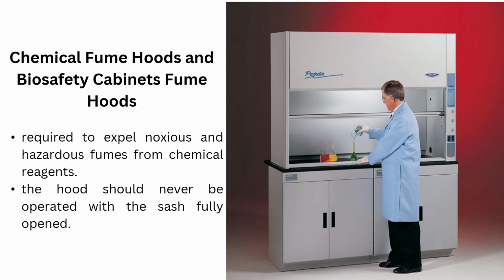The hood should never be operated with the sash fully opened, and a maximum operating sash height should be established and conspicuously marked. The containers and equipment positioned within hoods should not block airflow. Periodically, ventilation should be evaluated by measuring the face velocity with a calibrated velocity meter.